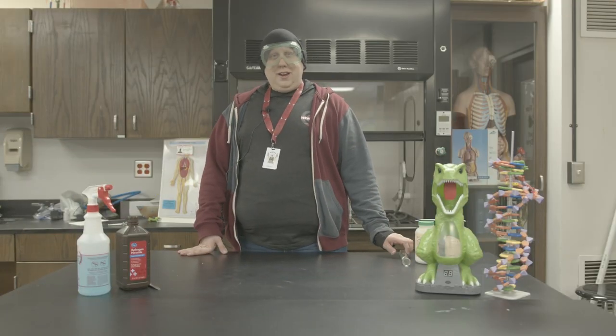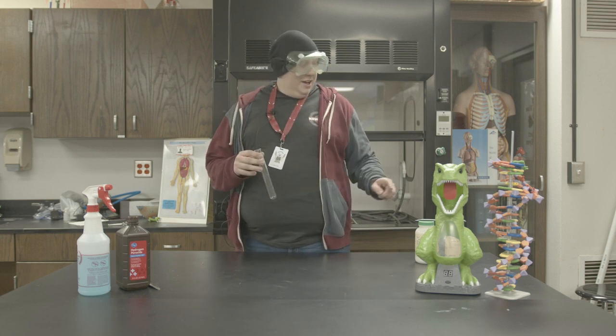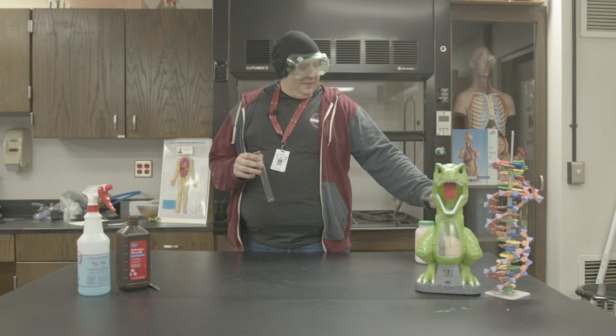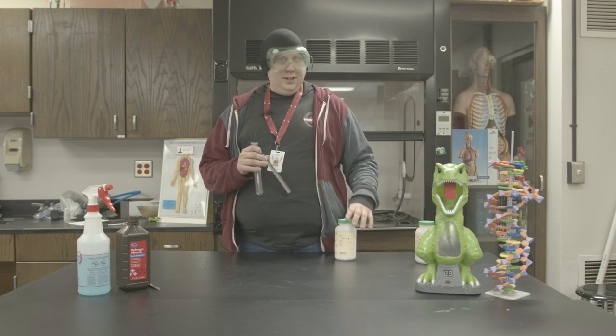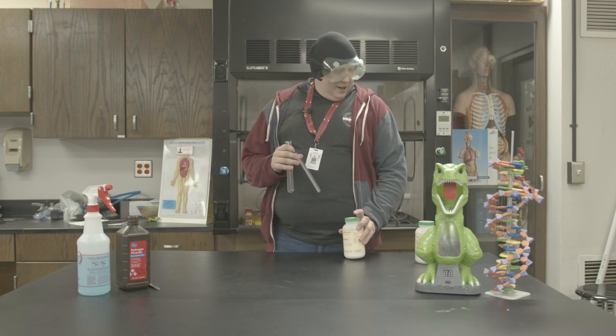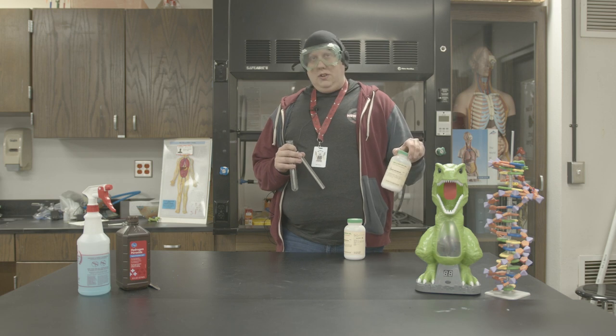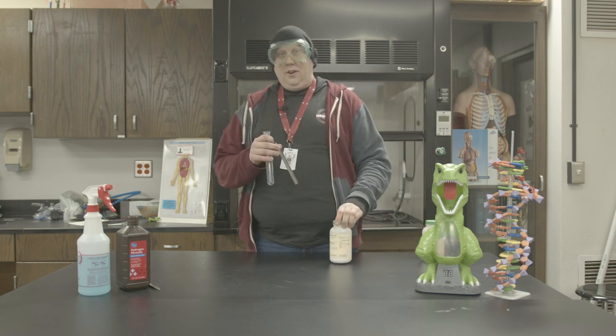All right, welcome back to Kenna's lab. I'm not wearing different clothes, you're wearing different clothes. So we're going to see what happens when you put a prisoner gummy bear inside of our special chemicals. We have potassium nitrate, and if that doesn't work, we have sodium chlorate. I'm pretty sure the potassium nitrate's gonna work just fine though.